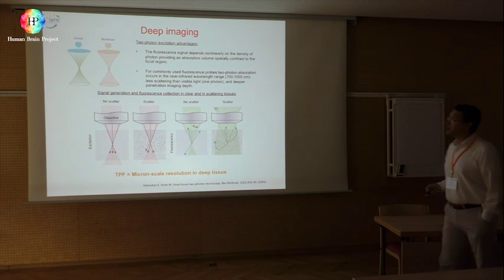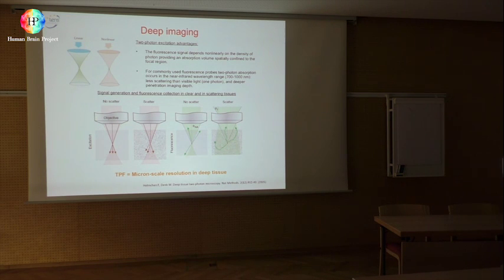If you take the brain, for example, and you want an image of the brain in vivo, the problem that you have here is that the brain is a diffusive system. It scatters photons. So the photons which are scattered, which are non-ballistic photons, go out of focus.